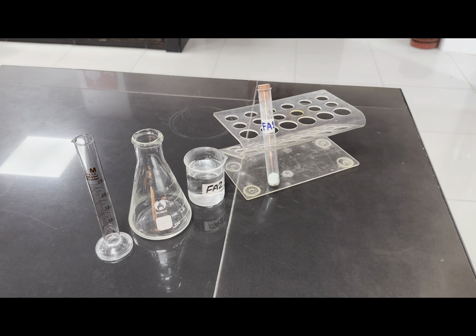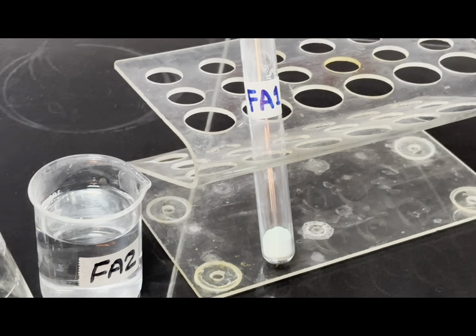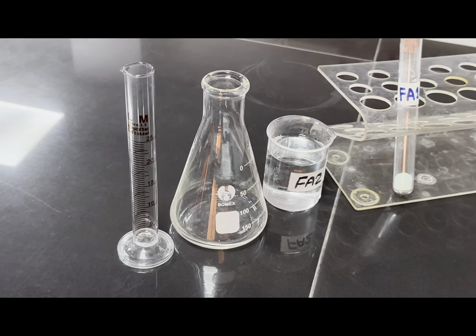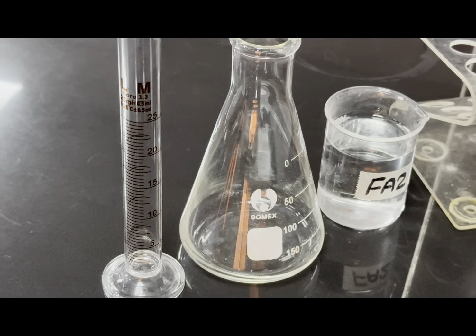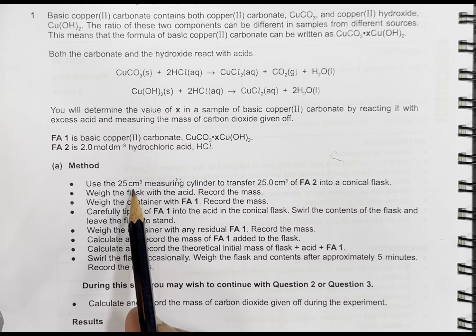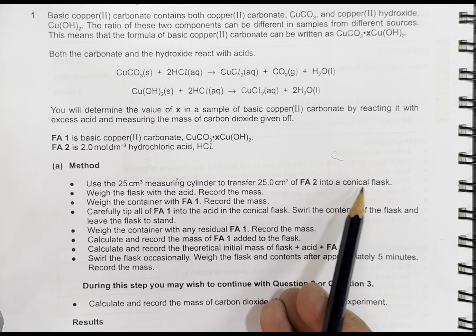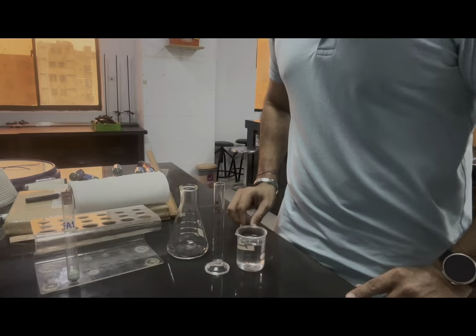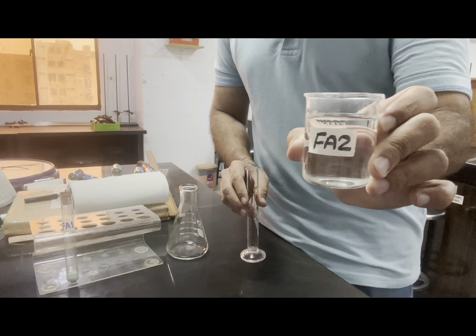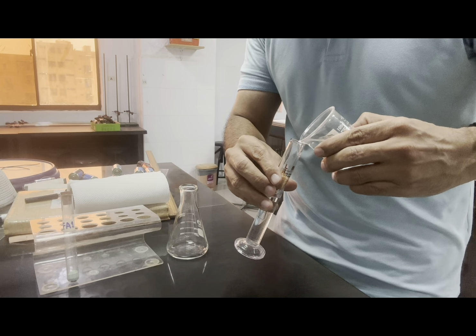Apparatus and chemicals given are: Fa1 is a green solid in a test tube with rubber bung. Then Fa2 is an aqueous solution, a conical flask, and a 25 cm³ measuring cylinder. Method: use the 25 cm³ measuring cylinder to transfer 25 cm³ of Fa2 into the conical flask.